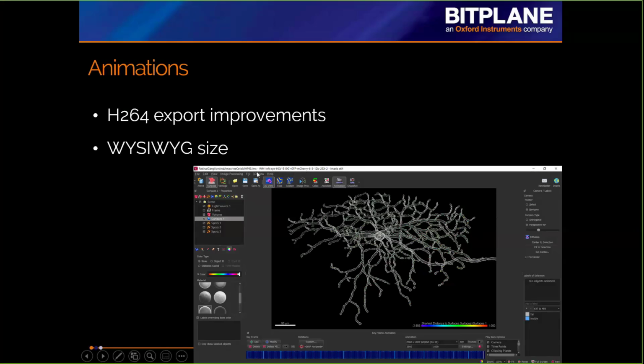that is then translated into what you see on the screen. So I have an entire screenshot here because I want you to see how there's gray bars on the left hand and on the right hand. So when you're exporting an animation or creating an animation, you know exactly what will be in that final result. And we find that when it's set up like this, you have much more control, and then you're much happier because you don't have to guess as to what will be in that final result. It really is what you see is what you get.